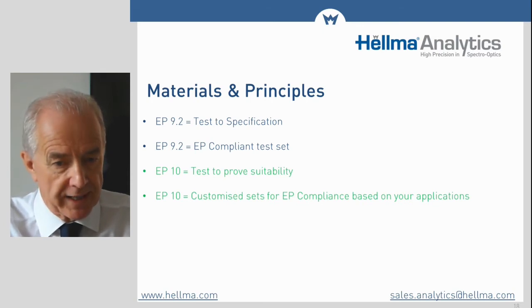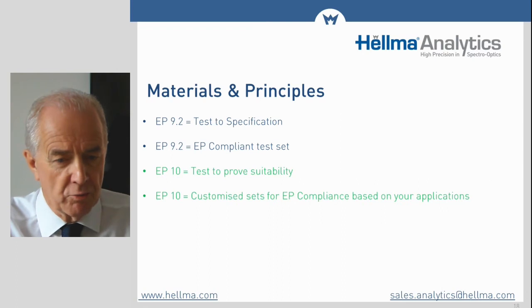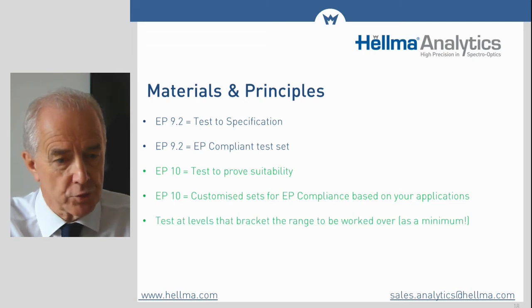Good laboratory practice would indicate that checking the spectrometer at levels that bracket the range it is intended to be used over will be the minimum requirement to prove suitability for purpose. And this is also the guidance given in the latest European Pharmacopoeia, EP10.